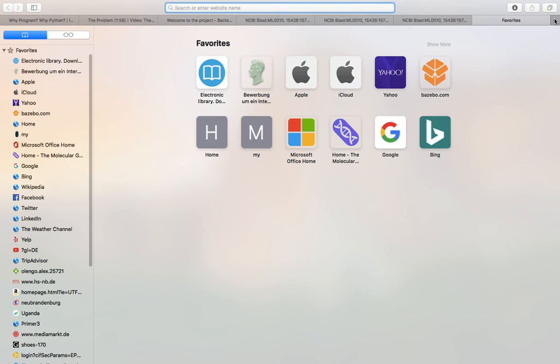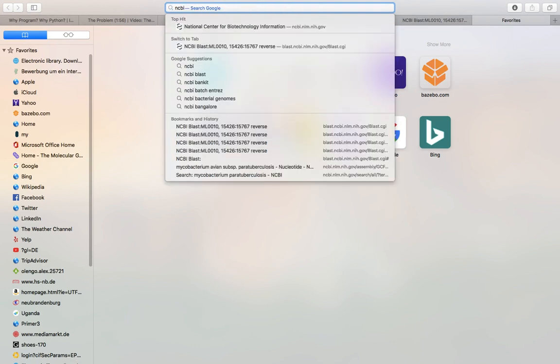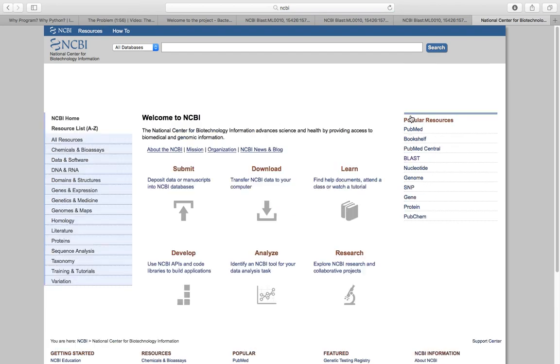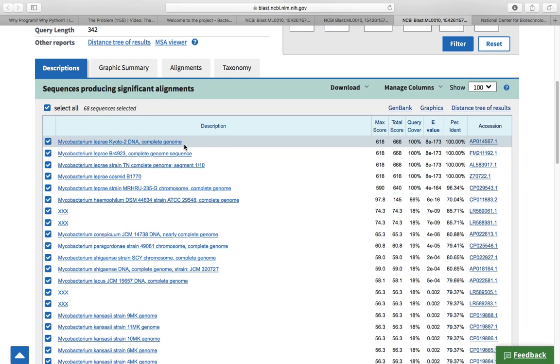Or you can just open up the NCBI BLAST, or NCBI. It will load. Yes. Then you open it up. Then you come to BLAST, which I normally find as a long process for me. So because I run the BLAST directly from Artemis, it has already given me the hits.